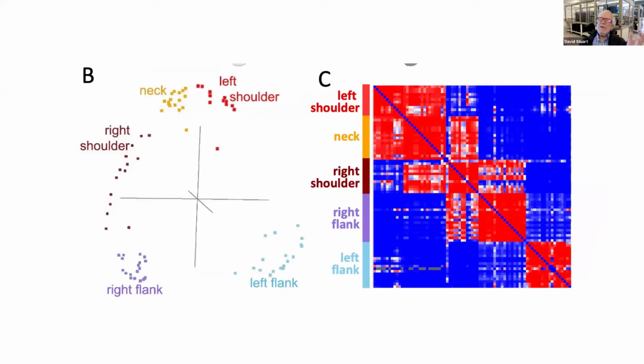So having got these 80 receptor binding domain antibodies, we then made the receptor binding domain and attached it to an Octet tip. So we're now using biolayer interferometry. What we do is attach the receptor binding domain to a tip, and then we go in with one antibody, and we see binding. We can read that out in the Octet machine. And then we go in with a second antibody to see if that second antibody can still bind in the presence of the first antibody.